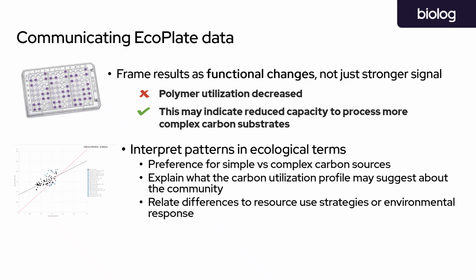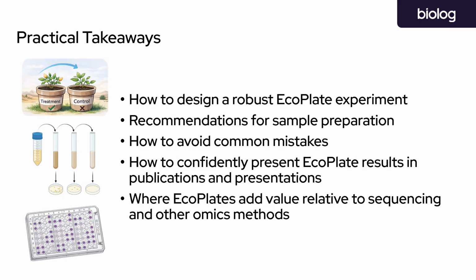And so some practical takeaways from this: hopefully you learned how to design a robust EcoPlate experiment, some recommendations for sample preparation, how to avoid some common mistakes, and how to confidently present EcoPlate results in your publications. Another thing that is important is that EcoPlates are very complementary to all these other techniques like 16S sequencing. Hopefully you've seen some examples of this during this webinar.